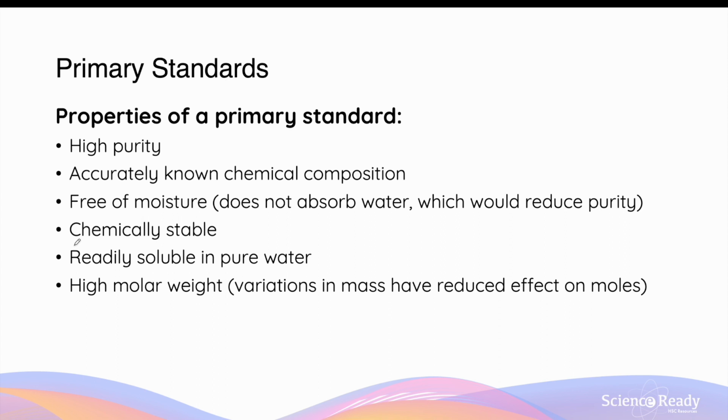The standard must also be chemically stable. We don't want the standard to chemically react with substances in the solution before the titration itself has taken place. The standard must be readily soluble in pure water. In the end, we want to create a standard solution, meaning that the substance should be able to dissolve quite easily in pure water.